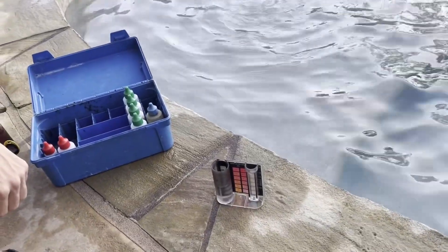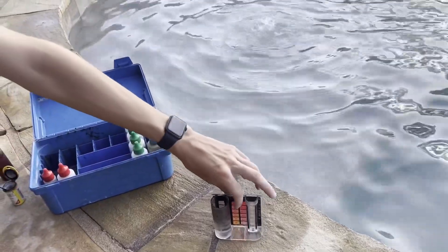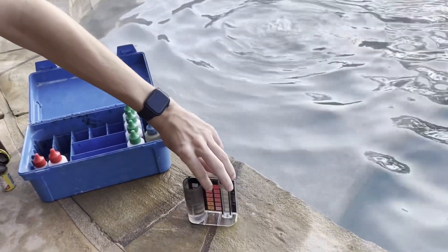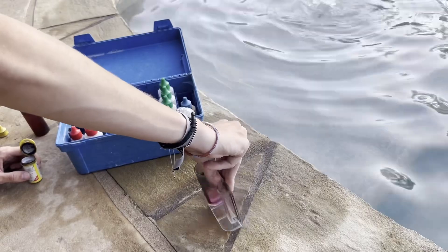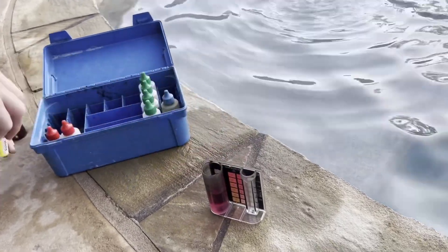For the second test, we're going to show you how accurate the DPD powder is. This is on the 0.2 scale, so you can see Jake has already got it filled to the 25 mark, which is right in the middle. He's going to put in the same amount of DPD powder. The test kit says two scoops, but we just do one giant heaping scoop, and that's usually about the same. So that turned the sample red, so we know there's chlorine.